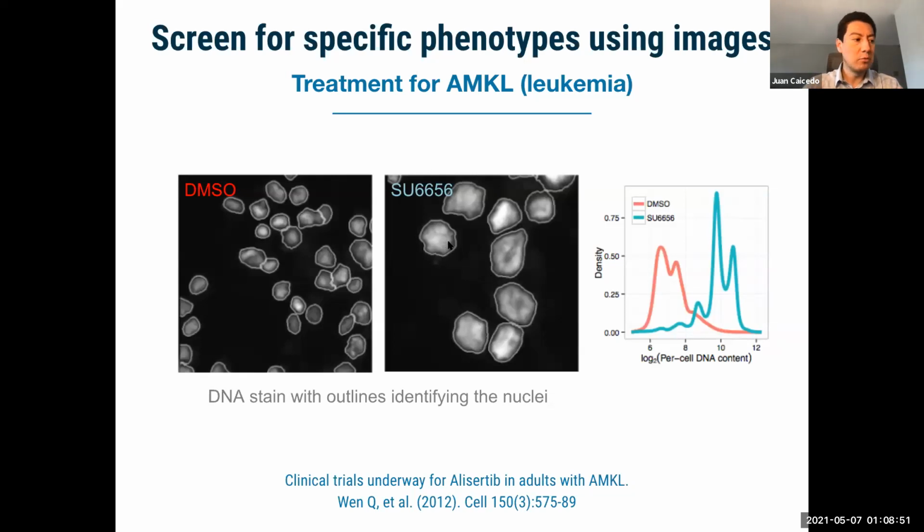There is one property which tells us when the cells are healthy again. In the image on the left, we see sick cells treated with a neutral compound. And on the right, we see cells treated with one specific compound, one of the candidates, in which the cells recover their normal size.